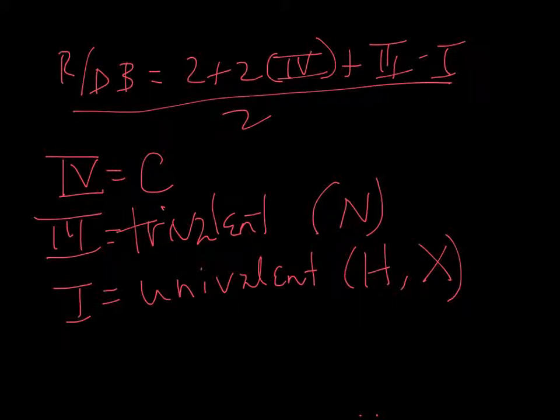Whenever you're given the spectrum, you're also going to be given the chemical formula. Use the chemical formula in the RDB very first thing. That's the rule of thumb. Just do that first. It will make your life much, much more simple.